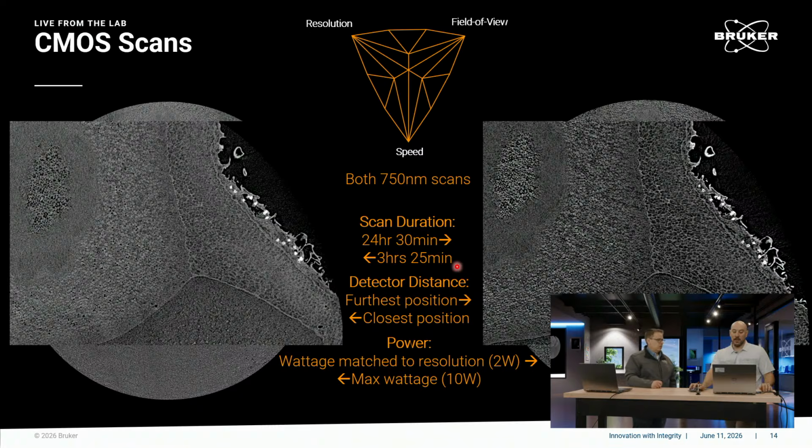But when you are optimizing your resolution, like you said, 2 microns is the smallest spot. It's still worthwhile to go to a smaller resolution, though, right? Yeah, absolutely. Like here, you went to 750. Right. And I know you've got a cool example, a way to think about it, like if you're looking at a circle. Oh yeah.